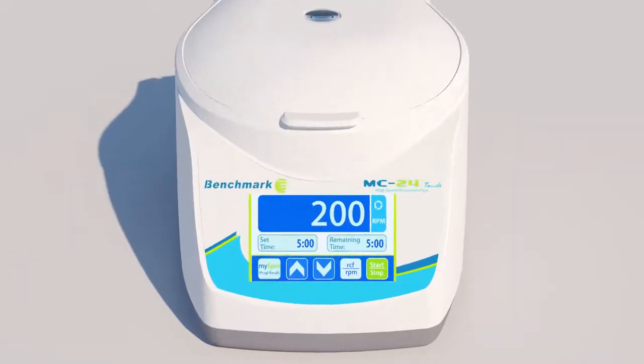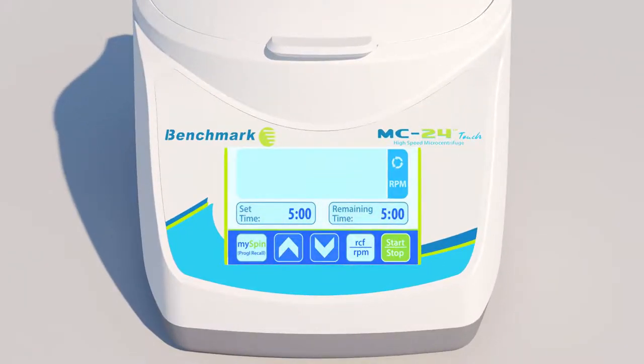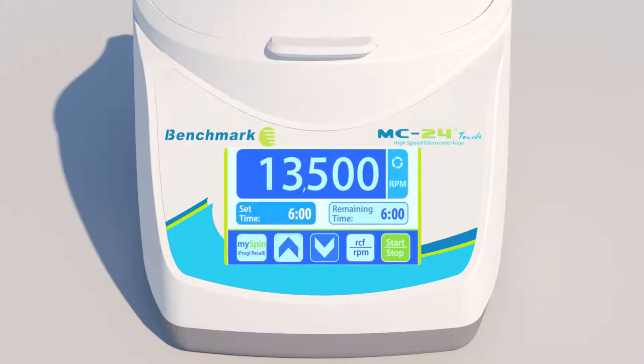simply close the lid and use the large, full-color touchscreen to select the desired speed and runtime settings. To begin the centrifugation, press the Start key. The lid automatically locks, and the rotor quickly accelerates to the set speed.